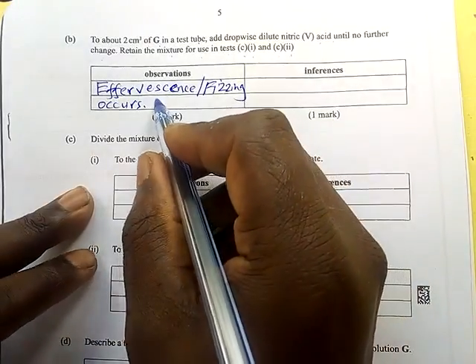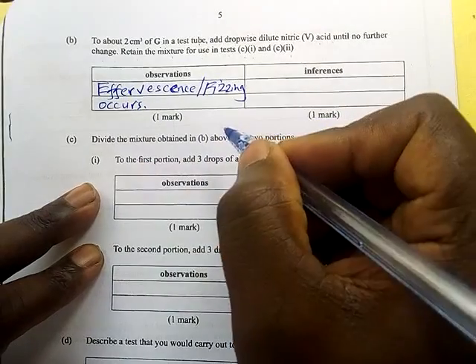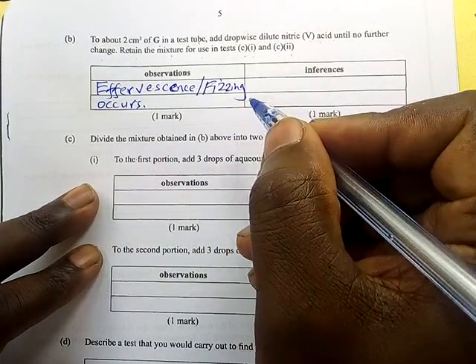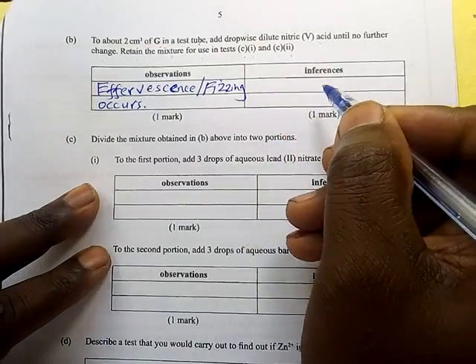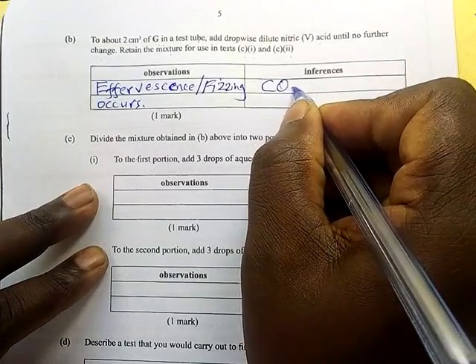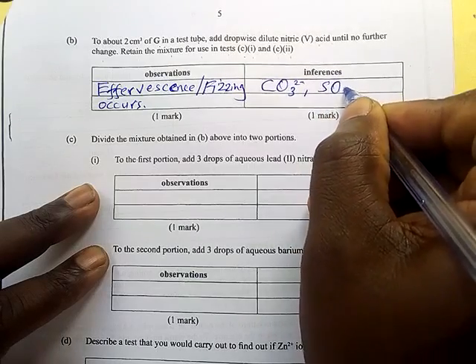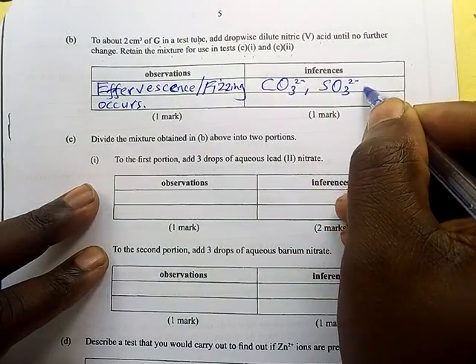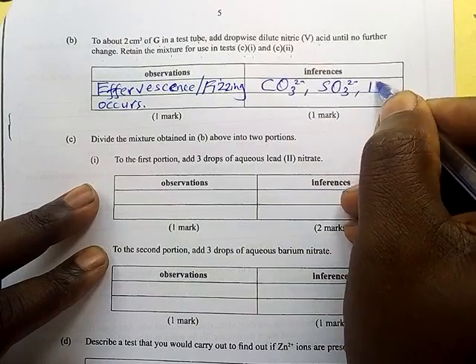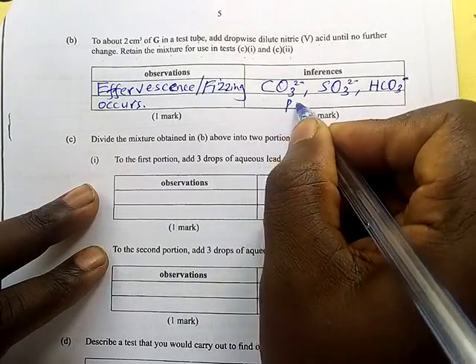Whenever effervescence is occurring, it means in that solution there was a carbonate, a sulfite, or hydrogen carbonate ions. So we are used to the carbonate, the sulfite. You can also add hydrogen carbonate present.